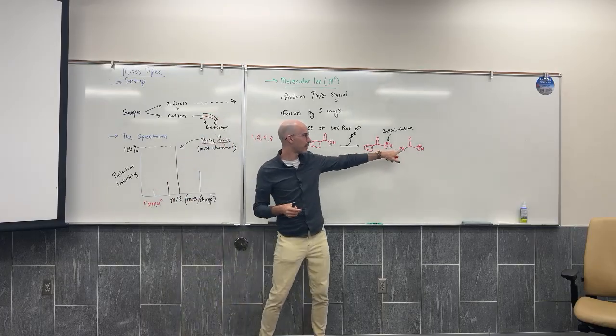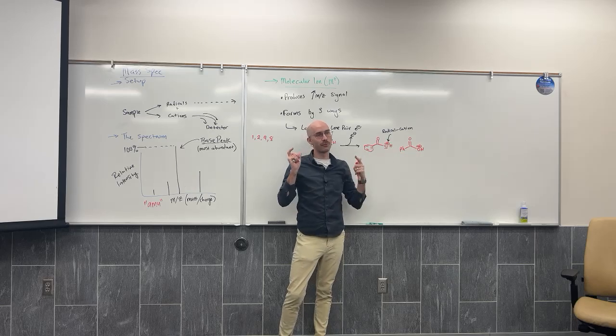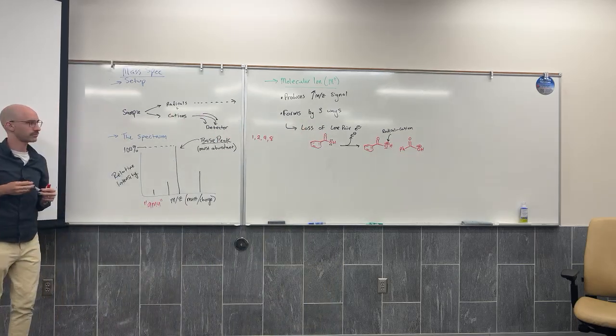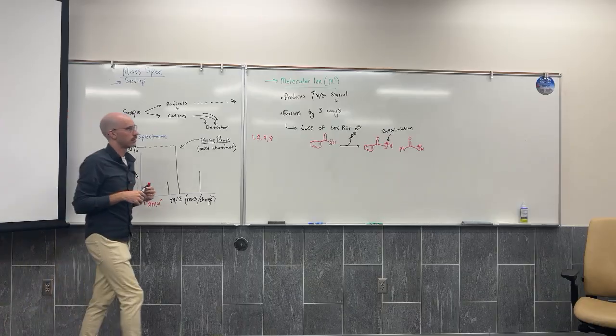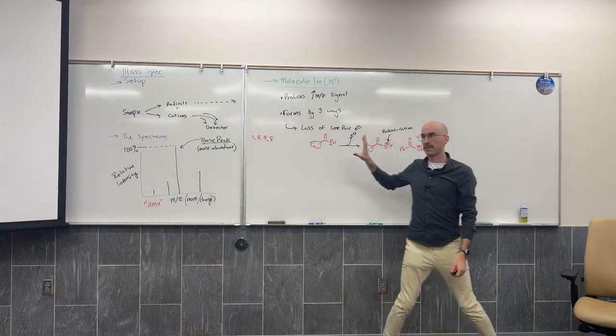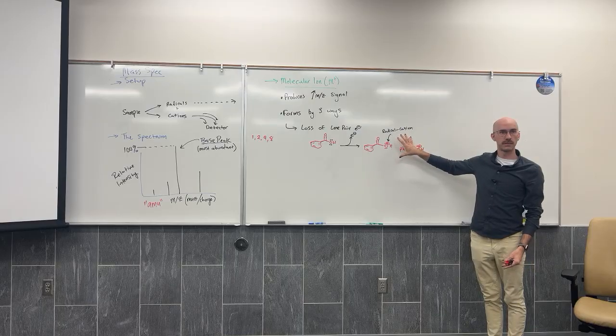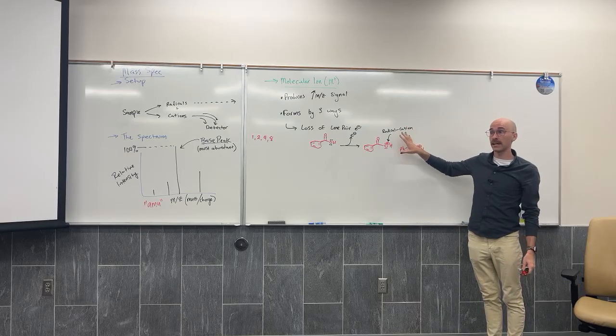That's not a lone pair anymore, is it? It's a radical, it's an unpaired electron. So we show that as well. This has the mass of the structure, and it will hit the detector. So it will give the highest possible mass per charge reading.